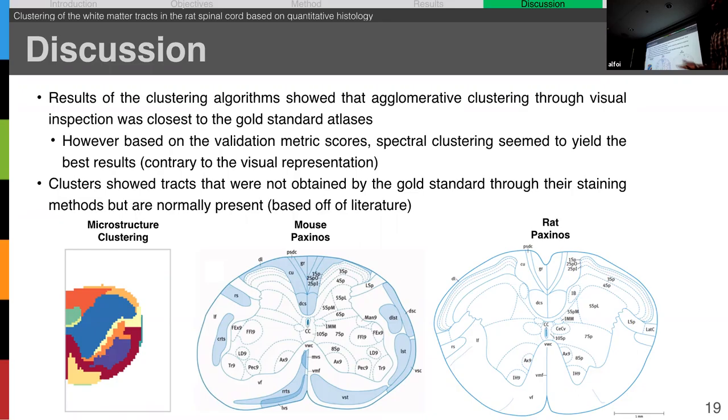At the current image resolution, we're not able to segment the smaller axons, and that's really an image resolution problem. These small axons are really important. Some areas have a larger density of smaller axons, and if we're looking at it visually, you'll see there is an abundance of them. You can manually correct for them too, which we kind of did, but it doesn't help as much unless you're really getting these smaller axons properly segmented.